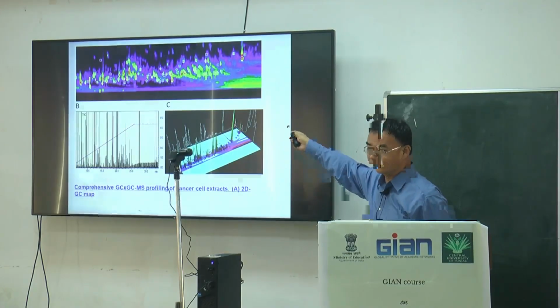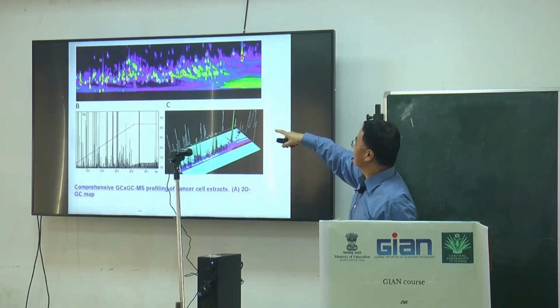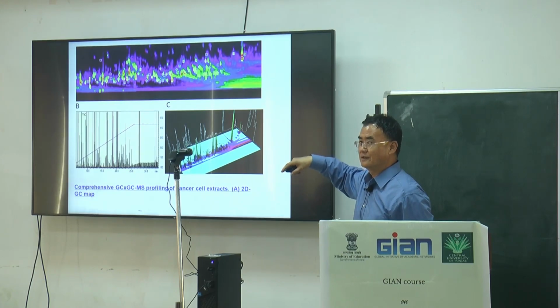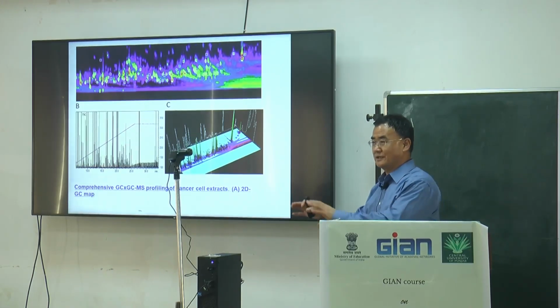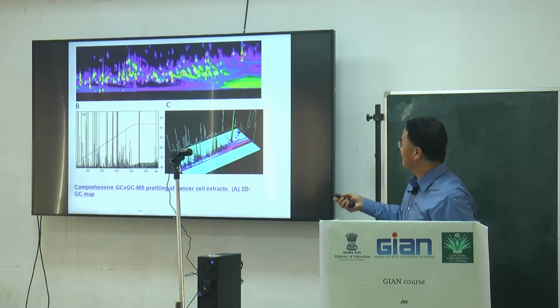They are developing some software to visualize metabolites in a colorful way. Just recently some software puts the data into a picture, which looks much better.